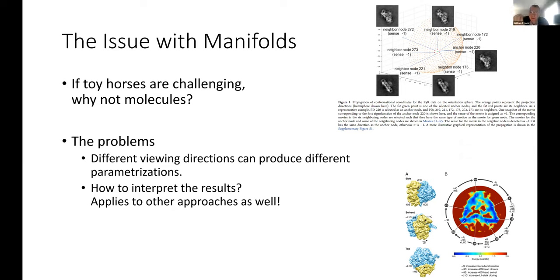So are there any tricks? I mean, with diffusion maps, there are a lot of different normalizations you can do to account for density. There is all this work that uses Mahalanobis distance. There are special cases where you can define an objective metric, or something that kind of fixes the metric. It's special cases, where something else is going on that allows you to do this.